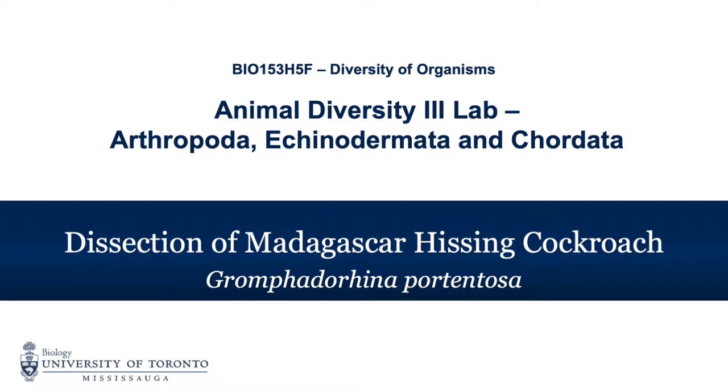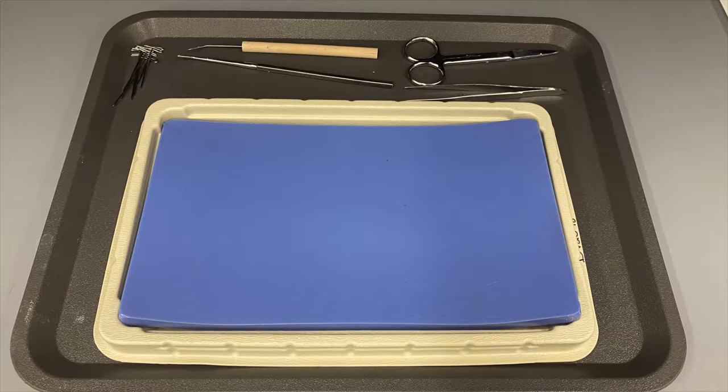This video will examine the external anatomy of the cockroach and then demonstrate how to dissect the cockroach in order to examine the internal anatomy.